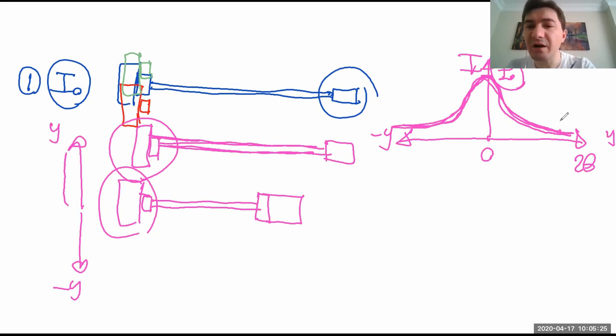But sometimes, for example, if the detector is staying like this, what do you see? The detector is a little bit shifted to the negative side, then the direct intensity will also shift to the negative side. Let me draw it.